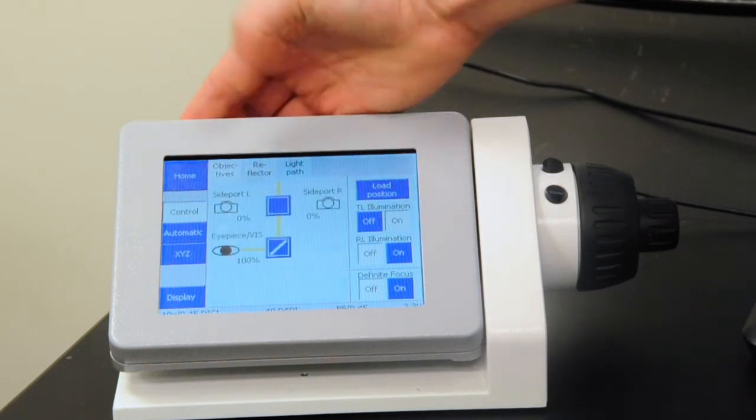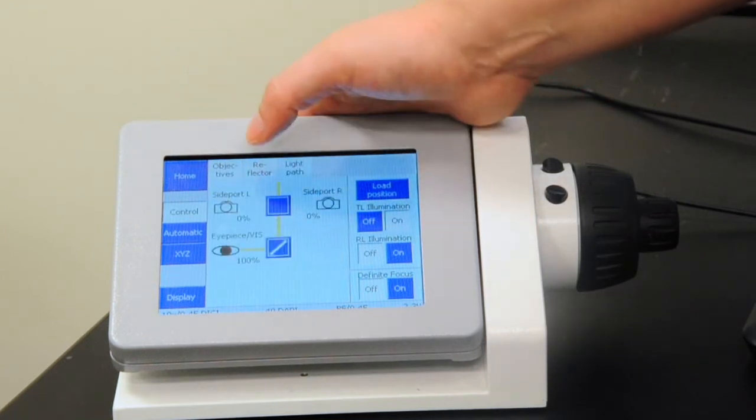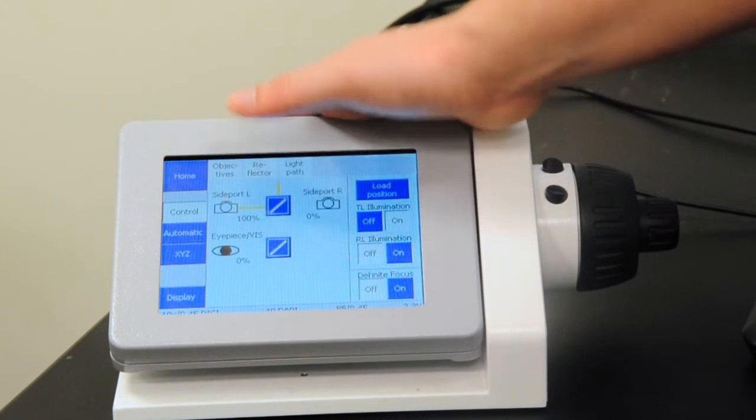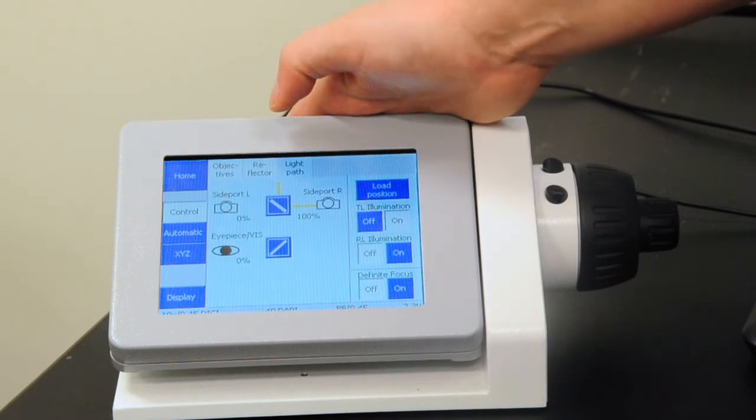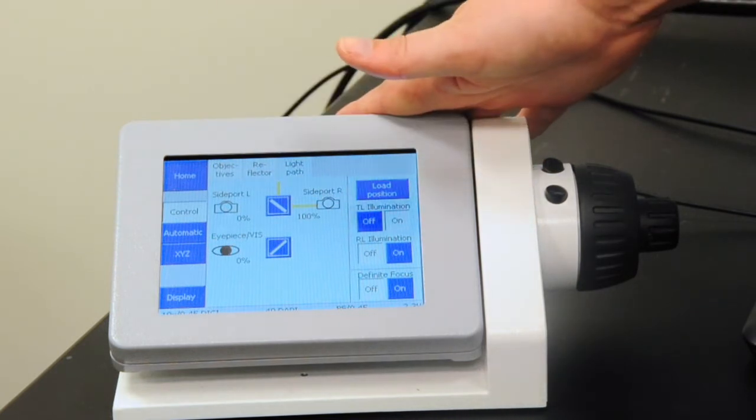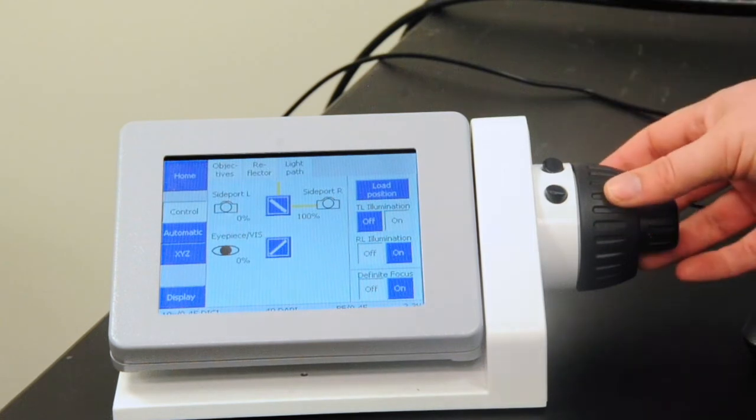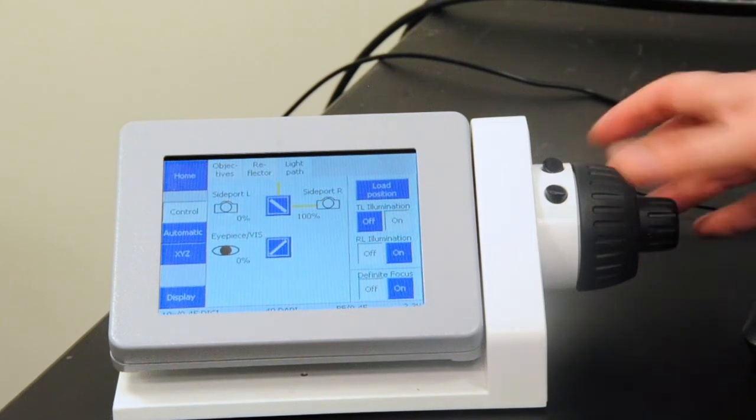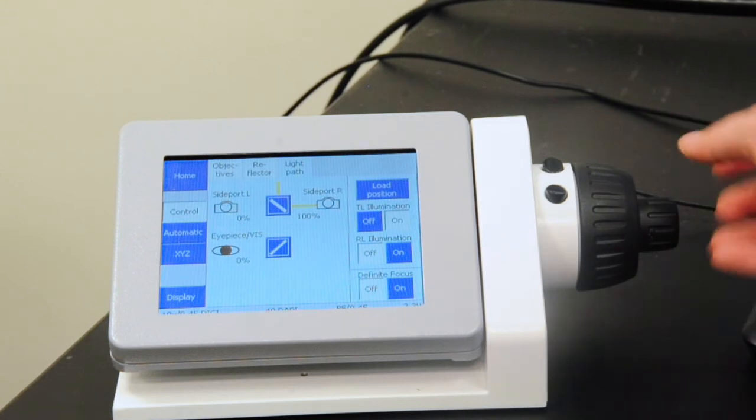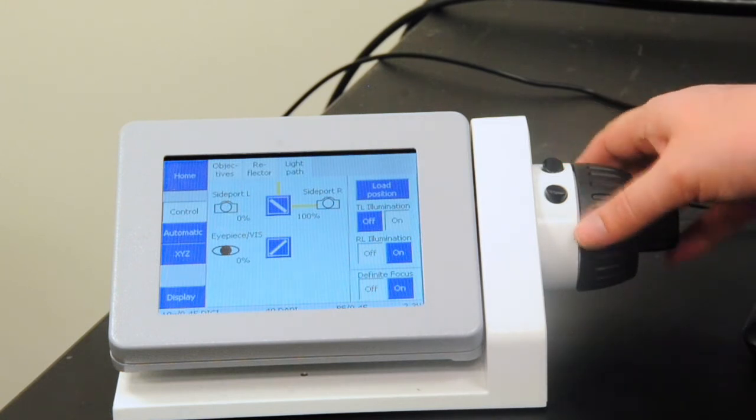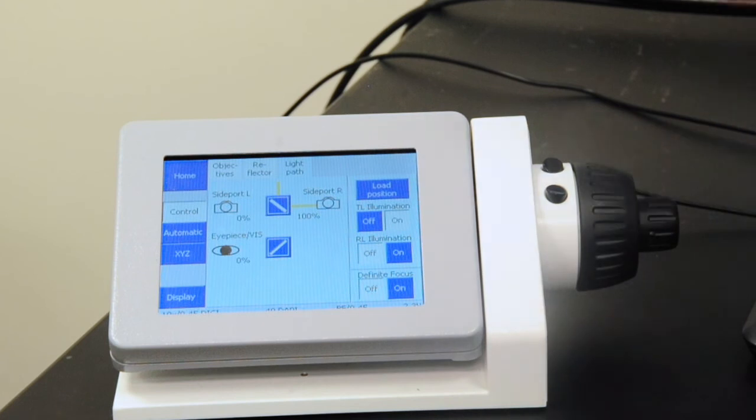And finally, in this, we have a light path where you can change where the light is going. But generally, it's much easier to do this via the software on the computer for a confocal microscope. Finally, on this, we have our coarse and fine focus so that once we have our sample where we want it, we can actually do our focus adjustment from here or in the software, and we don't have to leave sitting in front of the computer.